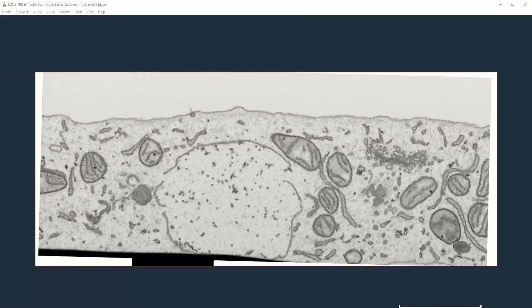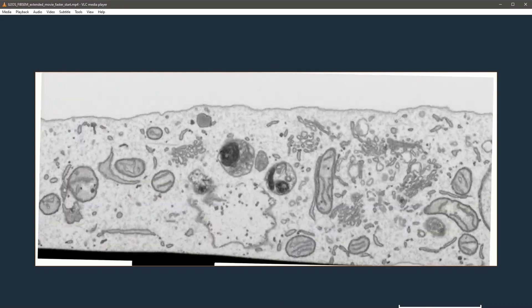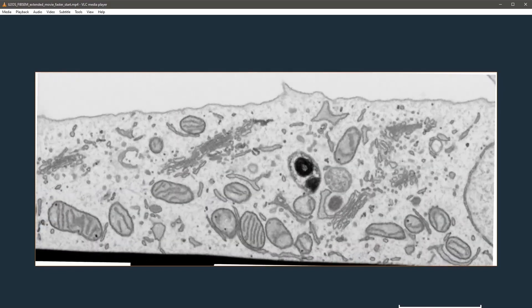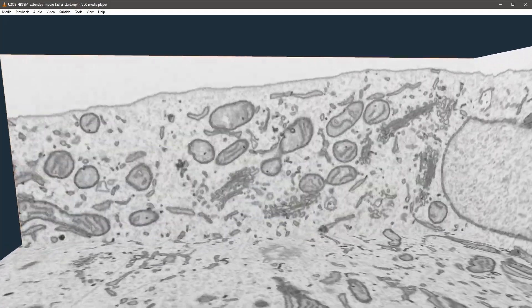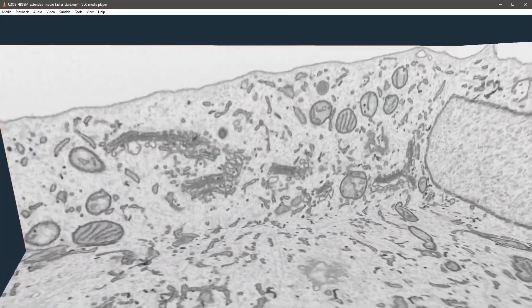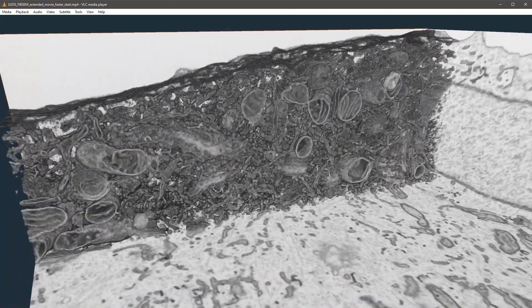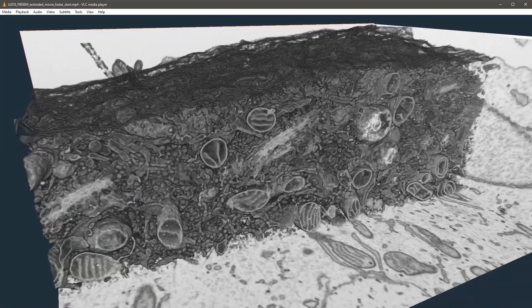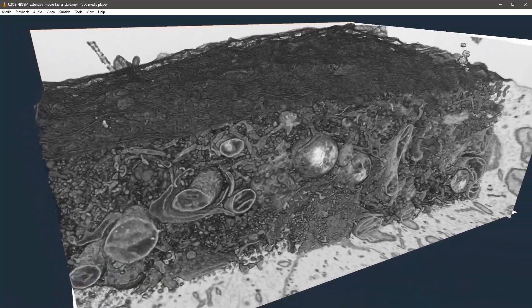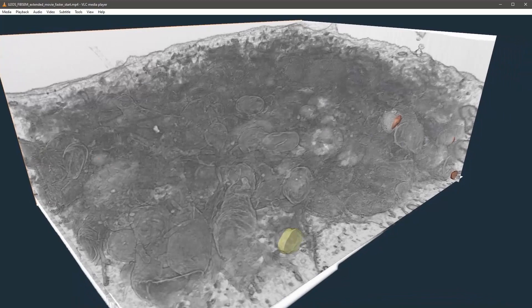Hello everyone. In this video I'd like to talk about application of convolutional neural networks for segmentation of volume electron microscopy datasets. The dataset on screen was obtained using focused ion beam scanning electron microscopy — it is a U2OS cell imaged with a resolution of 2.5nm in xy and 5nm in z orientation. With the gray you can see the volume rendering that shows how densely this cell is packed with organelles.